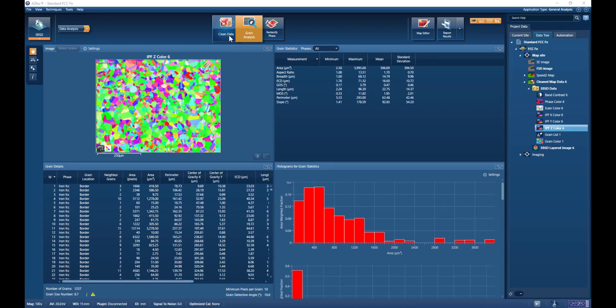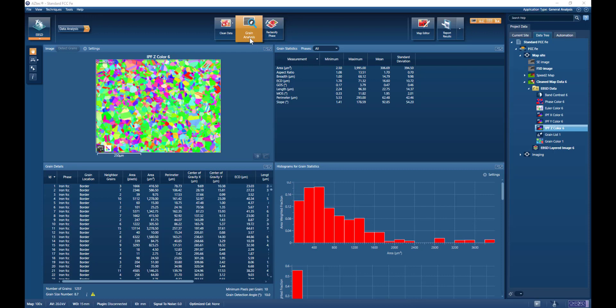We can clean up the data, we can go into the grain analysis mode, or we can look at the reclassify phase, which is a licensed option. I've gone straight into the grain analysis mode, but it is important when doing a grain analysis that the data has been cleaned up sufficiently so that reliable grain detection can occur.